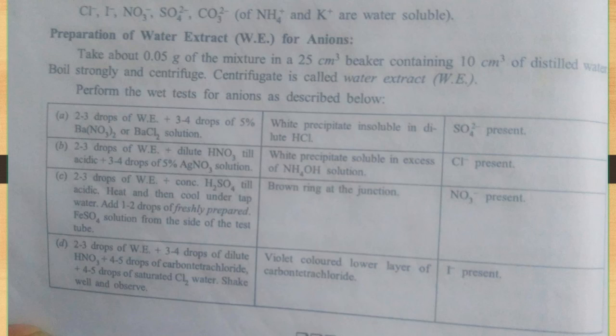It may be chloride, it may be nitrate, it may be iodide. So move further for the chloride ion test, for nitrate ion and for iodide ion. So remember, this is a very important note that whenever the anion is associated with the major cation, that should not be reported as impurity anion. That care is to be taken. So this is all about detection of impurity cation and impurity anion.